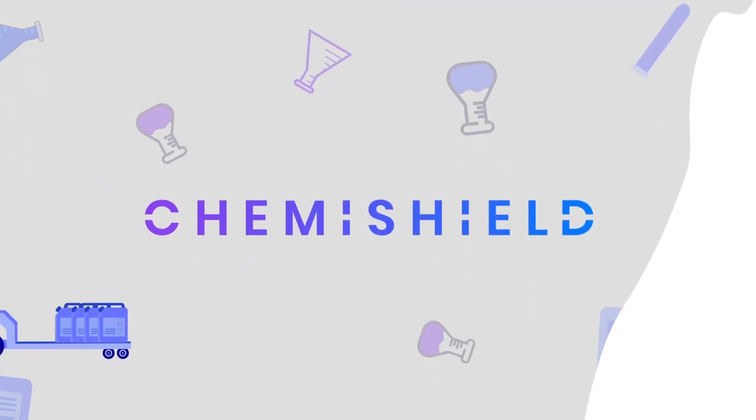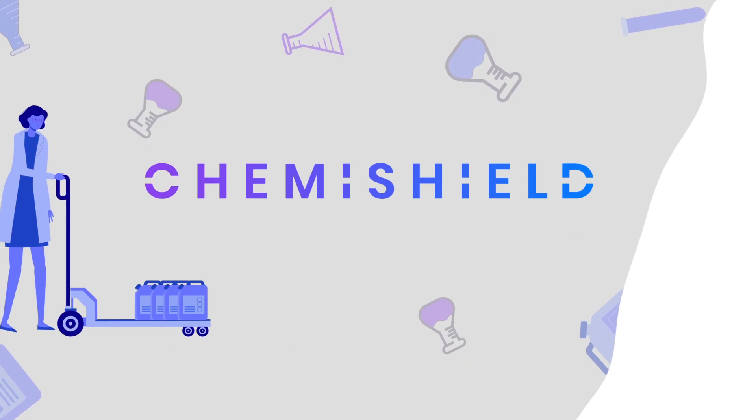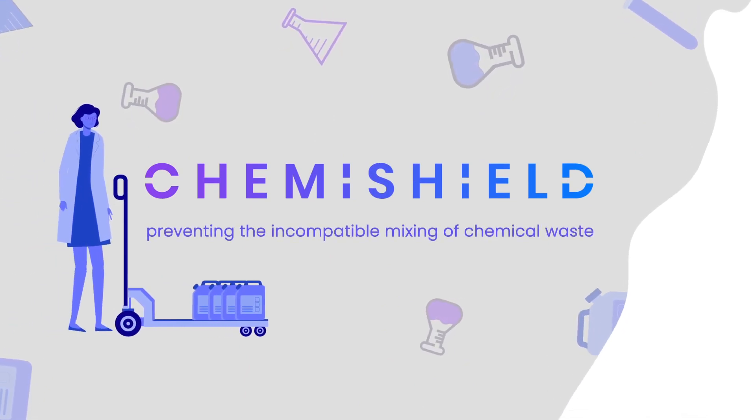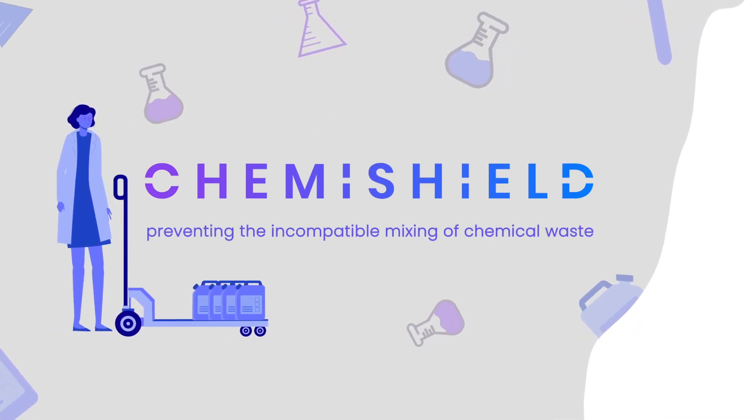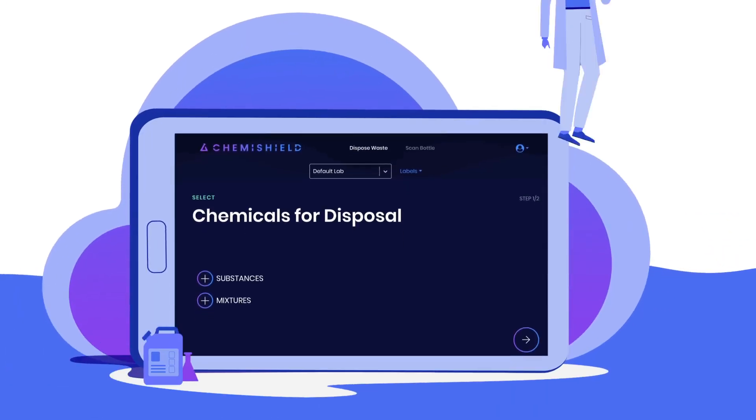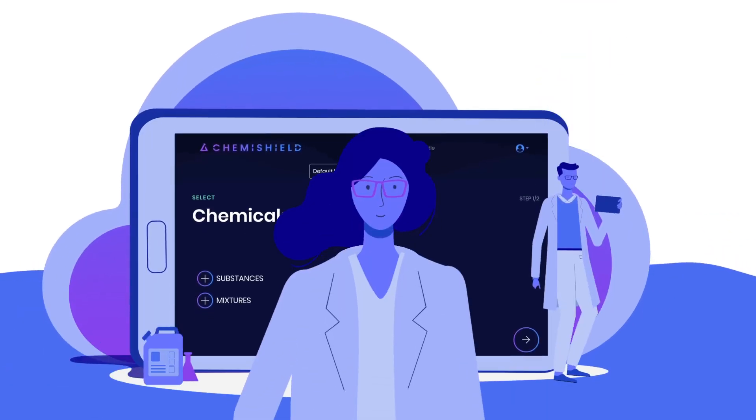Chemishield is a powerful hazardous waste management system that prevents the incompatible mixing of chemical waste. Our cloud-based platform will make disposing of your chemical waste easier and safer by removing the chances of human error.